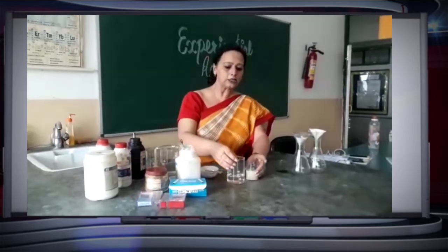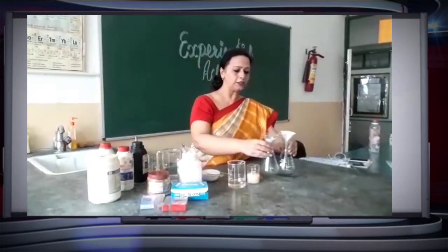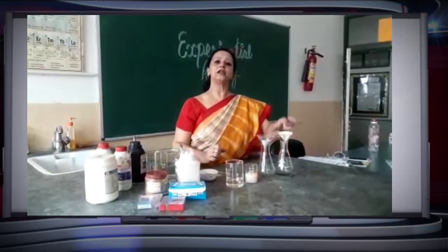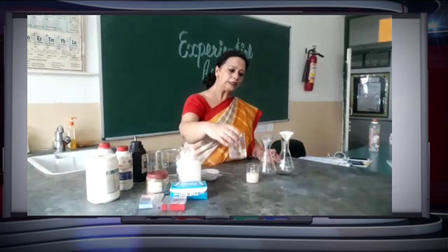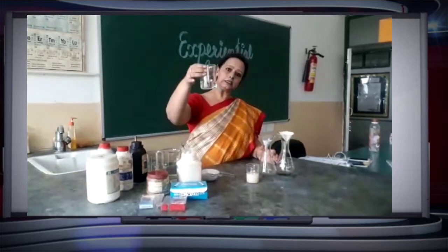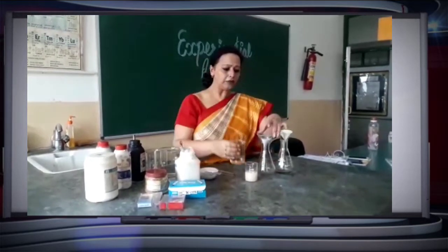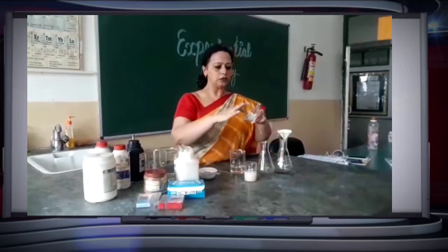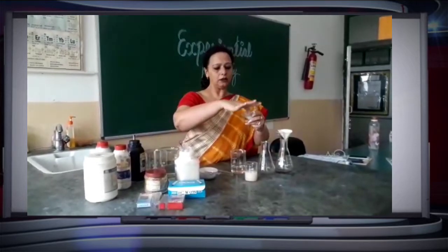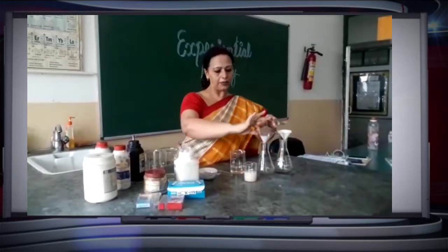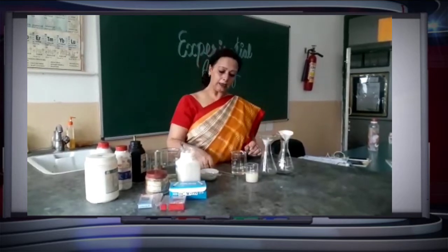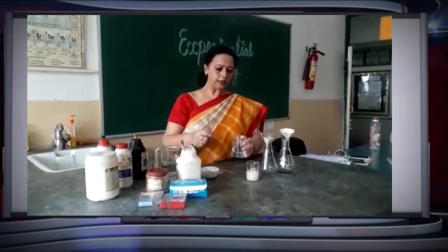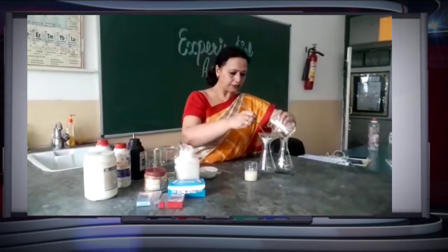Now let us talk about another property, that is the filtration criteria. If we want to filter — first of all the true solution — we will filter it from the filter paper. I have fixed this filter paper in the filtration apparatus and I am going to filter it. Let us see what happens.